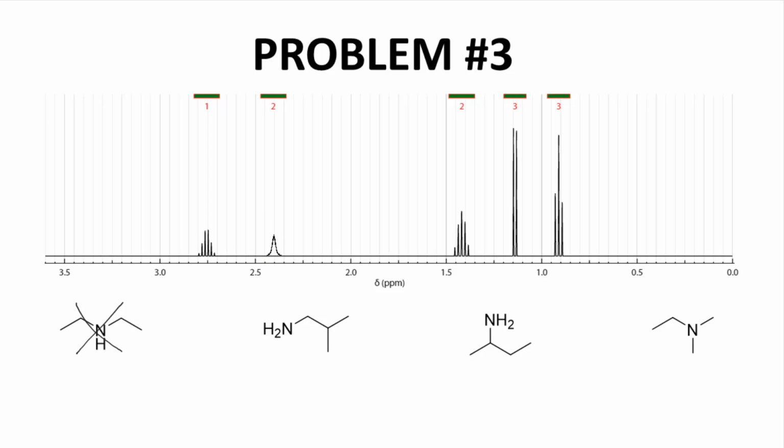And as it turns out, based on the structures we're given, that's really helpful information. Now, again, this is an NH with 2 hydrogens. We look at our next structure. Oh, this has an NH2. That is a possibility. We haven't looked at the rest of the spectrum, but that at least belongs under consideration. Our next structure also has an NH2, so that's a possibility. Our last structure doesn't have any NHs, so we can eliminate that from the get-go.